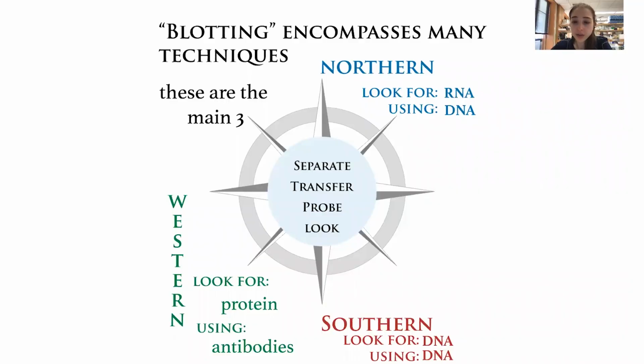Okay, so I'm going to start with an overview, some similarities and differences between these different methods, as well as some of the reasons why you might want to use various ones in different situations. And so, for example, although we use western blots a lot still, for northern and southern blots, a lot of the uses have been like superseded by PCR-based methods.